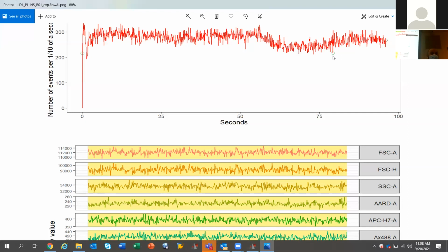One thing I would also recommend when you're running your samples, do not change the flow rate mid-acquisition. Whatever you run your controls with is what you're supposed to run your samples with. Also, do not run your samples on high unless you're working on a sorter and you need your cells really, really fast. It lowers your quality. However, you get probably higher viability. But with an analyzer, keep it at medium or low if you're working with a BD instrument. If you're working with another manufacturer, speak to them, but never run it at the equivalent of a fast BD cytometer.